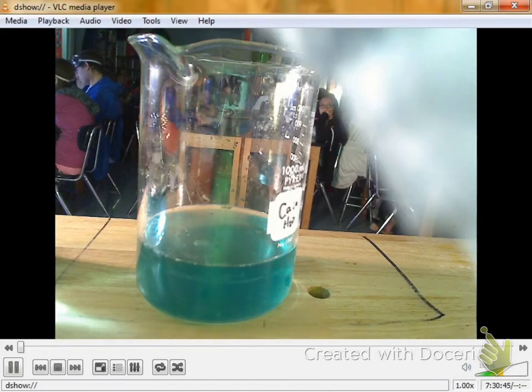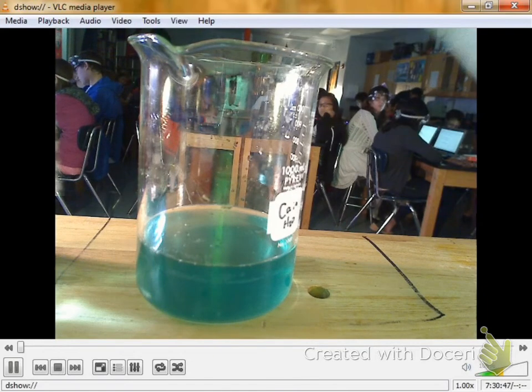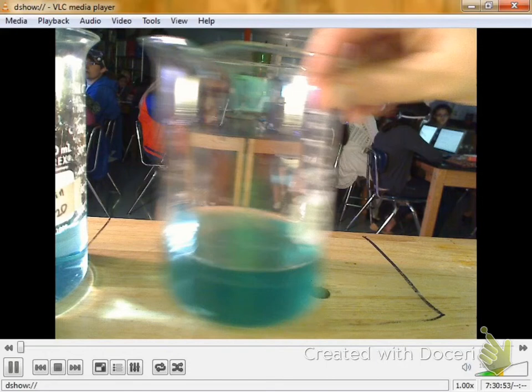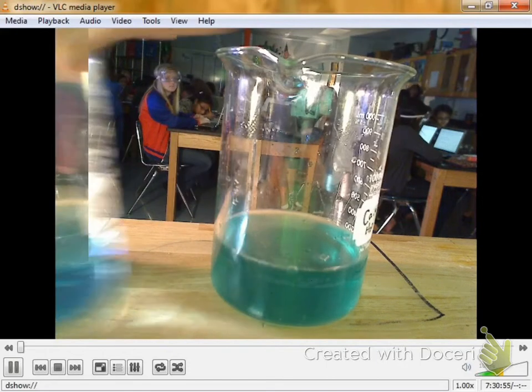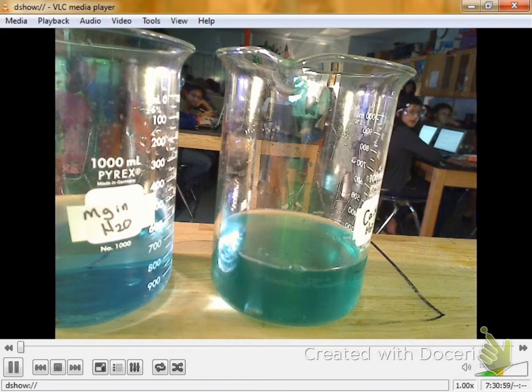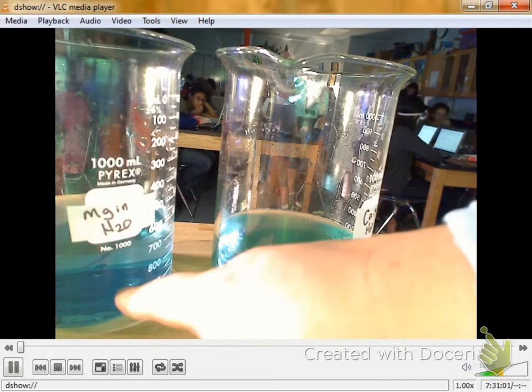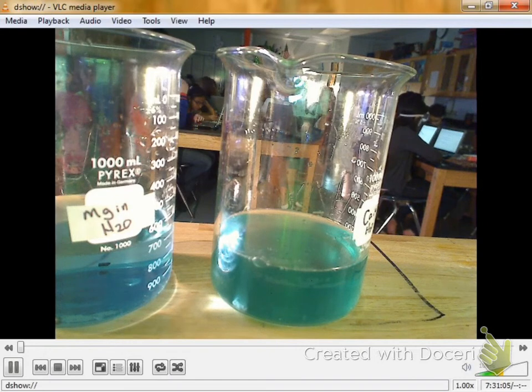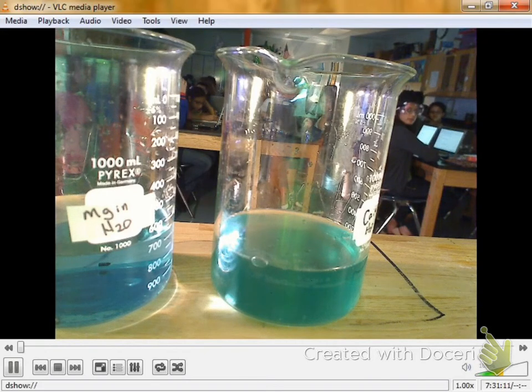Here, I'll set that one over there. Now it's barely in the picture. Yeah, this is calcium and water. That's the magnesium and water. Nice and blue. Kind of green up. Almost looks like icky pool water now, doesn't it? Gee, I don't want to go swimming in that. Yeah, so I'm thinking I don't want to go swimming in there.